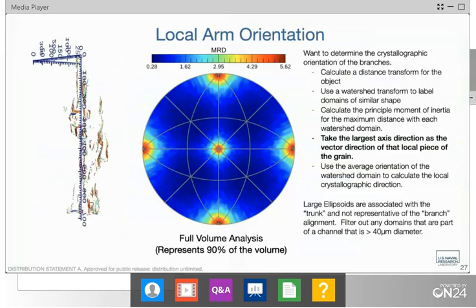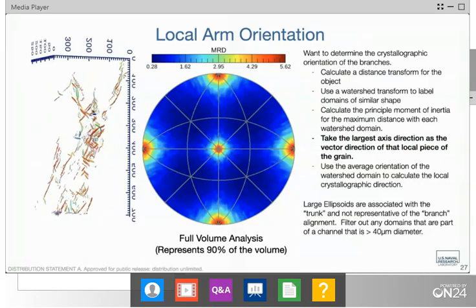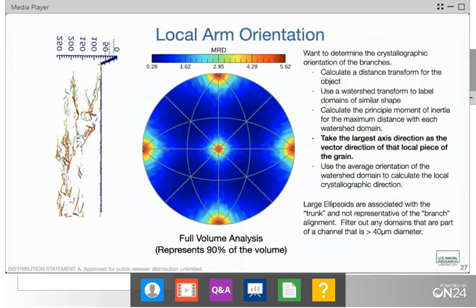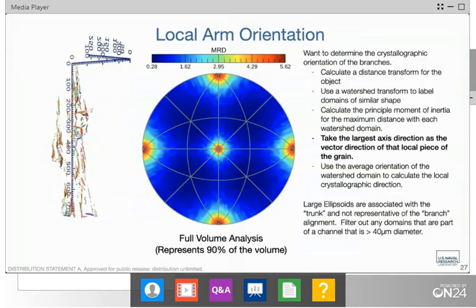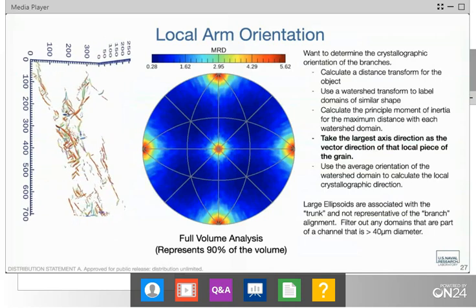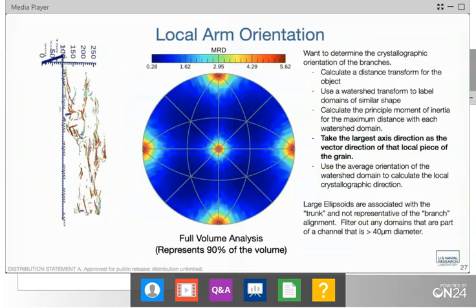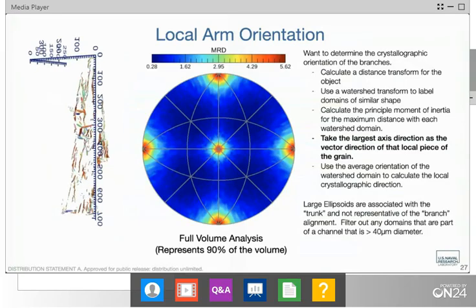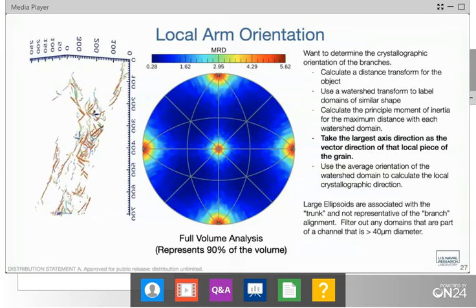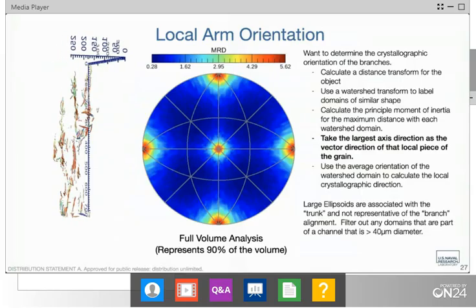Are you sure that these large areas are grains? That's a very good question. In my recent TEM studies, and I think this is getting to what I just talked about, they might be several separate grains that grow almost epitaxially on top of each other. If you look at the detailed formation, there are these cellular structures. We think this is happening from a cellular solidification standpoint, where you get some level of segregation between what would be dendrites, but they don't have time to develop arms of the same orientation. And we think they very much are growing epitaxially from layer to layer.